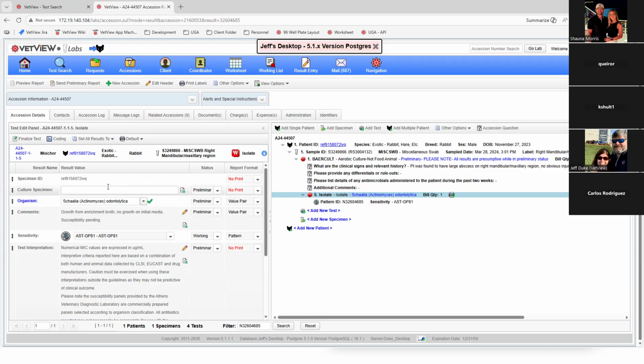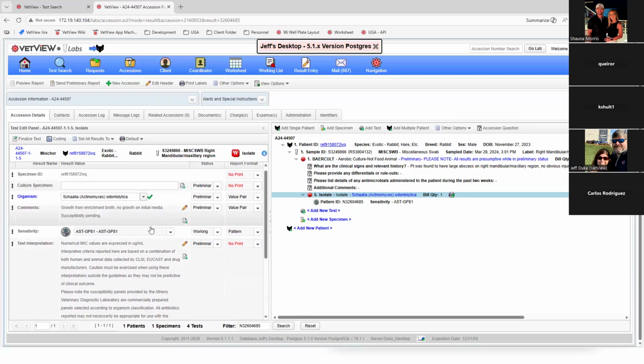And you can choose which version wins, or you can copy it and update their version if it's something you want to merge together. But the system will automatically detect that and prevent you from just overwriting someone else's data without you knowing it. All that is checked in the background for you in the system. Again, it's okay if you're on different result fields. It's only if you try to update the same result at the same time in the system that will automatically get detected and flag it for you when you try to hit save in the system.